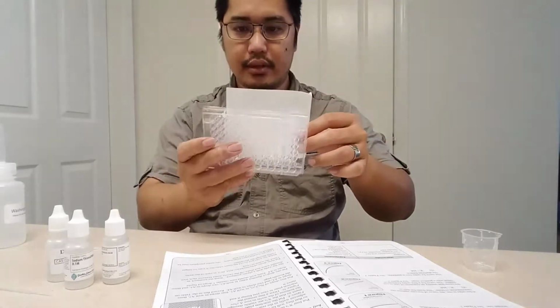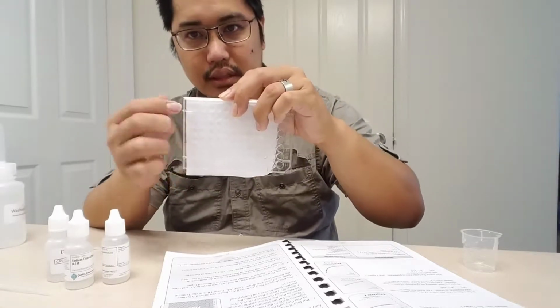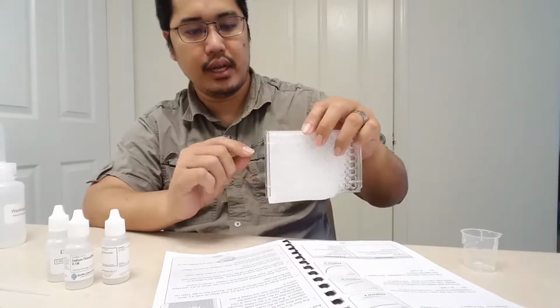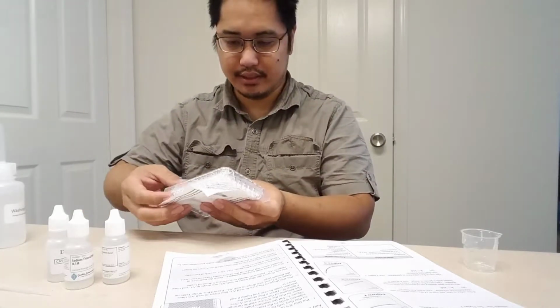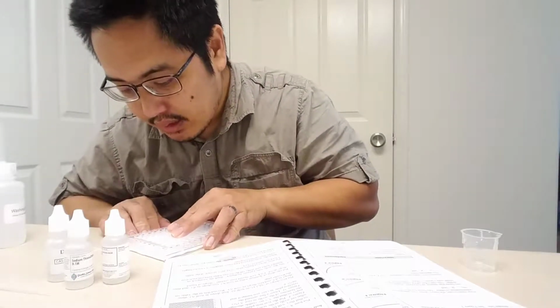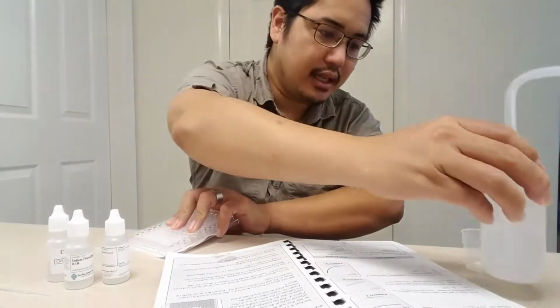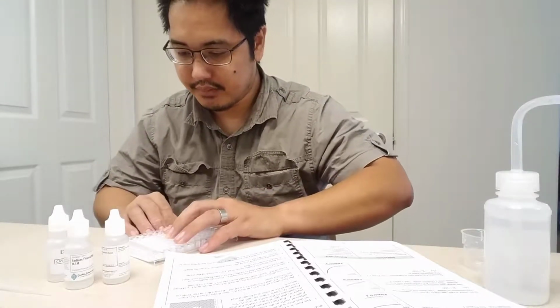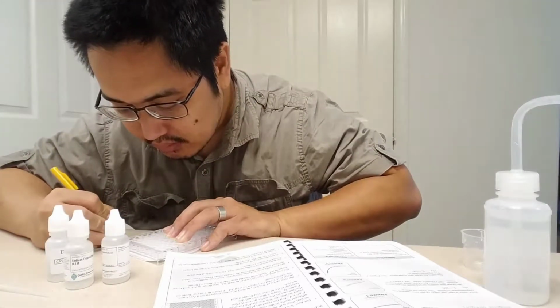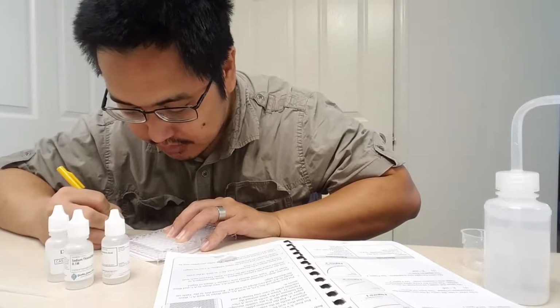And what you're going to want to do is put X's right underneath these circles in wells A1 through A4. The way to do that is I'm just going to take my paper and line it up right here, leaving a little bit of space up on top. In that space up on top, I'm going to put little X's right where it lines up with the dots.